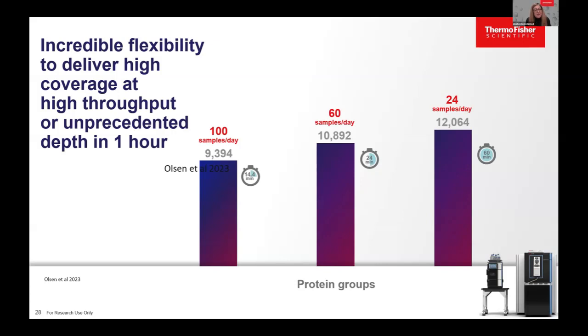And do the discovery in a more powered way than doing the discovery in a less powered way, and then having to evaluate it with a larger cohort for verification. Now you can do your discovery in a really well powered, bigger study, then your biomarker has a better chance of succeeding in downstream verification. Hopefully together we can change the way people do discovery proteomics, even from cell, tissue, or plasma, it doesn't matter.